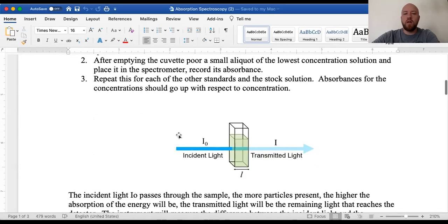If we haven't done the physical properties lab yet, essentially in that lab, we are reporting density as a way to correlate to percent concentration. Because again, if you have a single glass of Kool-Aid and you put 1 scoop in there, the volume of water in your glass is not changing, but what's changing is how many scoops of Kool-Aid you keep putting in there.